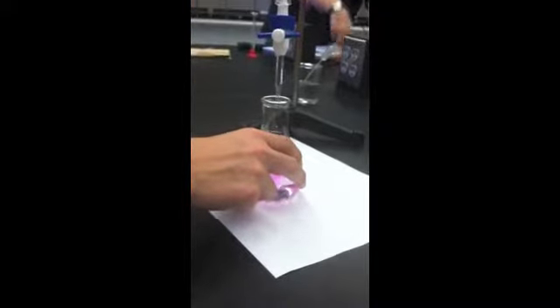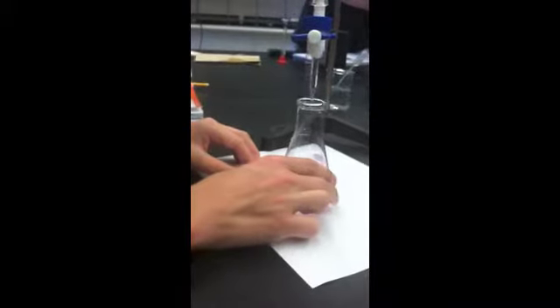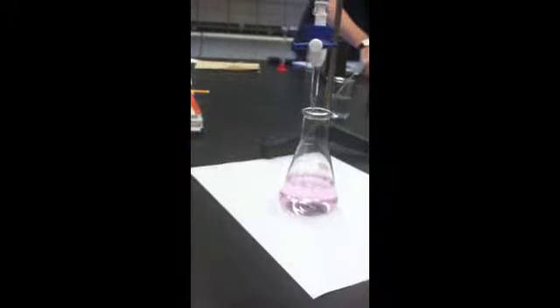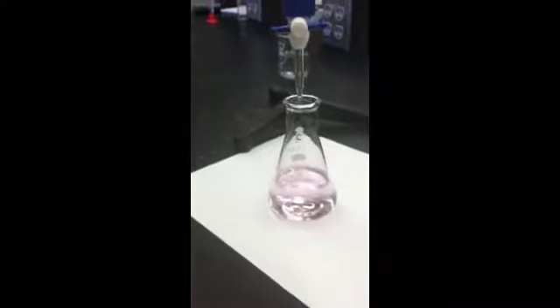Now he's going to release some of the NaOH, gently swirl the flask until it turns a light pink, which you should see soon. Now he's going to record the final.